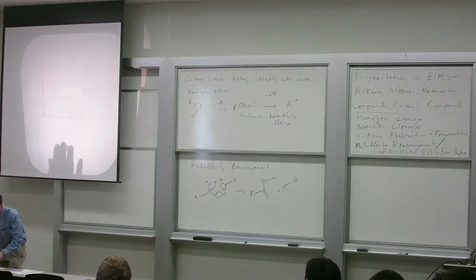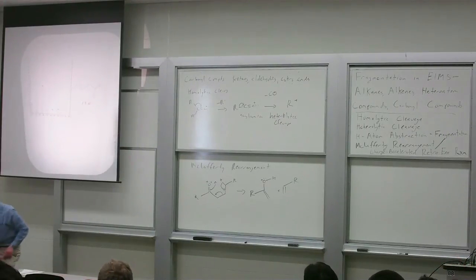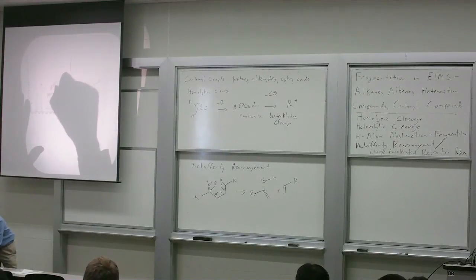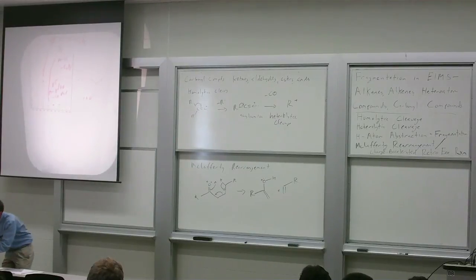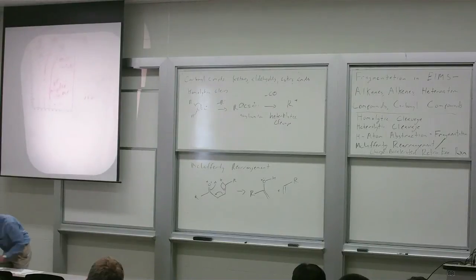Just remember the lone pair, you can take electrons off either the carbonyl or the nitrogen. So here is hexanone, and you'll notice we have a peak at 100, which is your molecular ion, a peak at 85, which is M-15, which is loss of a methyl, a peak at 71, which corresponds to M-29, which is loss of an ethyl. We also have a peak at 58, that's M-42, that's our McLafferty rearrangement, C3H6 is getting lost here, and then we have our base peak at 43, which is M-57, which is loss of a butyl.